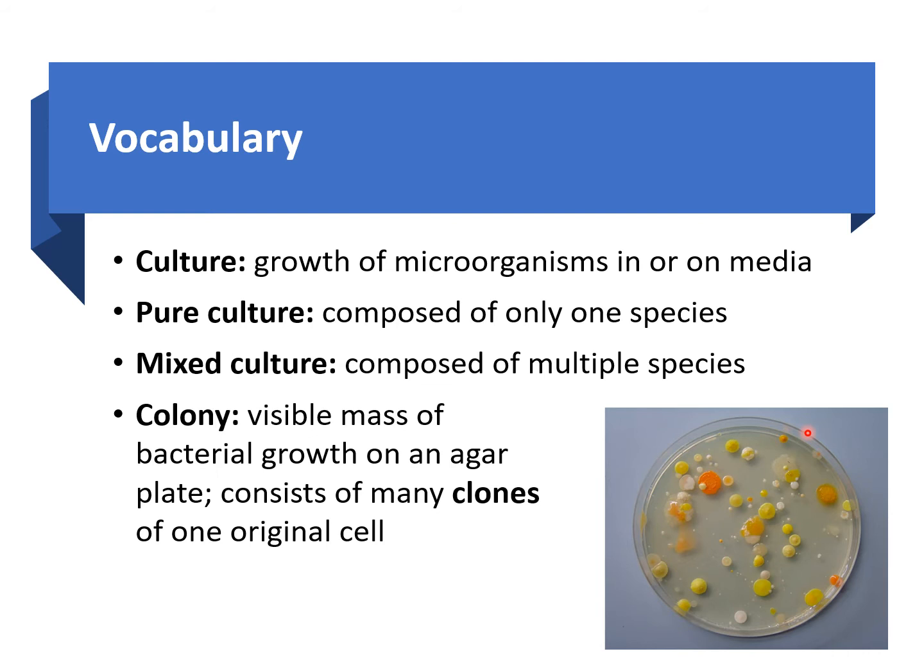Why should you spot all of these differences when you look at a plate? You have to make sure that you are looking for all of these differences that we've just discussed, because that's going to give you an idea whether you are looking at a mixed culture or a pure culture. A mixed culture is basically when you have multiple species of bacteria cultured on that one plate. And this plate right here is a mixed culture. How do I know it's a mixed culture? Because of all of the differences that I've just laid out, right?